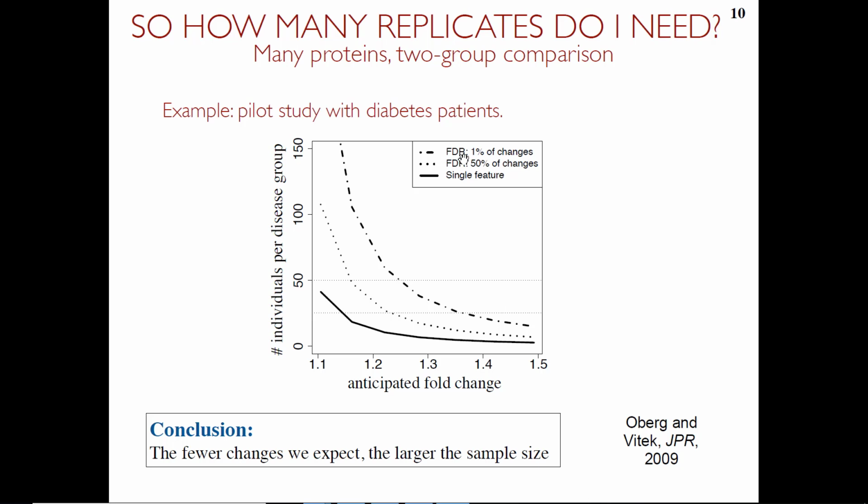And so we have two conclusions. Not only do we need a larger sample size when we have more proteins, but it also depends on what kind of experiment we have. For example, if we have a targeted experiment with more proteins, but we target them because we expect them to be changing, we would not need to work as hard in terms of sample size as in a discovery experiment where only 1% of proteins are expected to change.